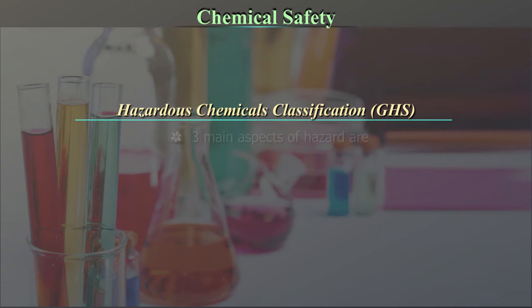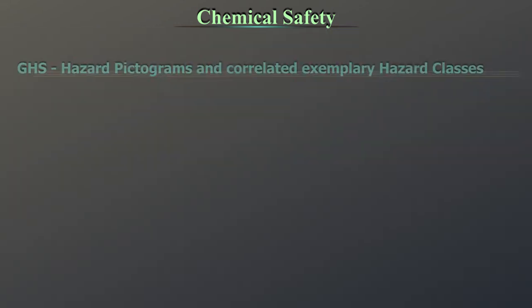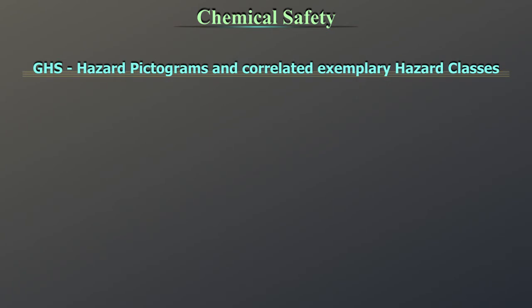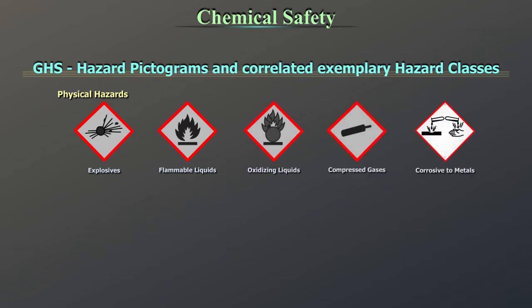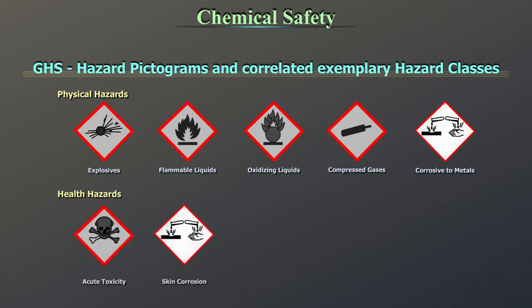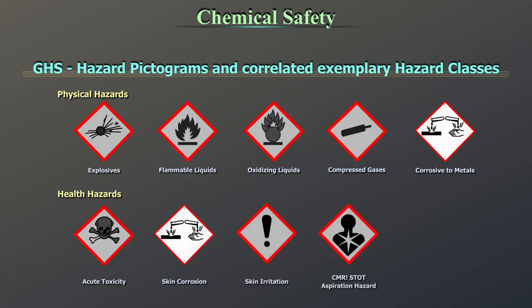Hazardous chemicals are classified under GHS. Three main aspects of hazard are identified: physical, health, and environmental. GHS hazard pictograms and correlated exemplary hazard classes include: Physical hazards — explosives, flammable liquids, oxidizing liquids, compressed gases, corrosive to metals; Health hazards — acute toxicity, skin corrosion, skin irritation, CMR or STOT, aspiration hazard; Environmental hazards — hazardous to the aquatic environment. CMR stands for Carcinogenic, Germ Cell Mutagenic, Toxic to Reproduction, and STOT stands for Specific Target Organ Toxicity.